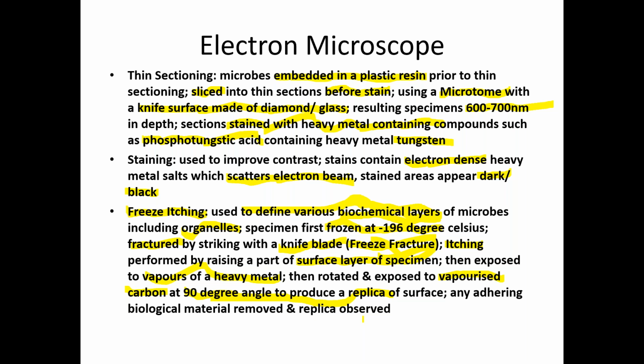What is artifact formation? Artifact formation is nothing but, if we are not preparing the specimen as per the required parameters, there is a possibility that when we are observing through the electron microscope, we will misunderstand an improperly prepared specimen as some microbial cells. Clear? That's why we have to make sure that in electron microscopy the specimen preparation is done very precisely, because none of us has any experience doing electron microscope specimen preparation. It is not a common thing.